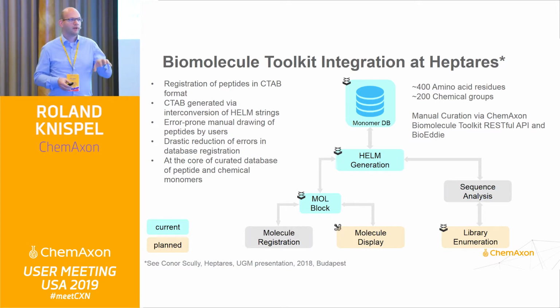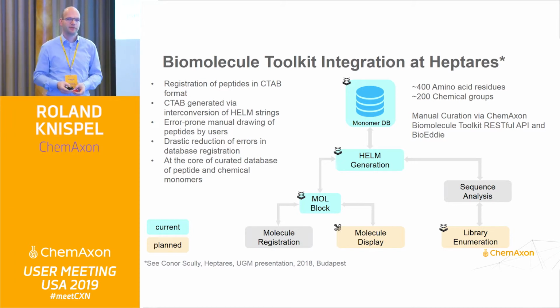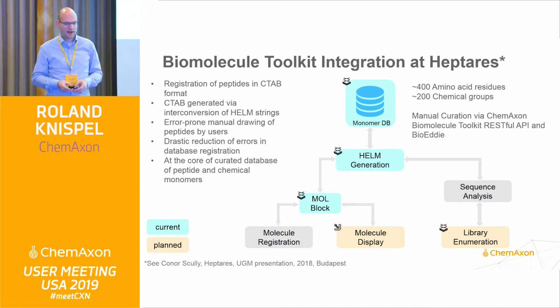Then, with the help of our conversion engine, going from the chemical structure, looking at which combination of building blocks in the library actually makes up the chemical graph, it generates the corresponding correct sequences based on the actual information of the drawing, getting rid of some of the inaccuracies of missing stereocenters and so on and so forth.